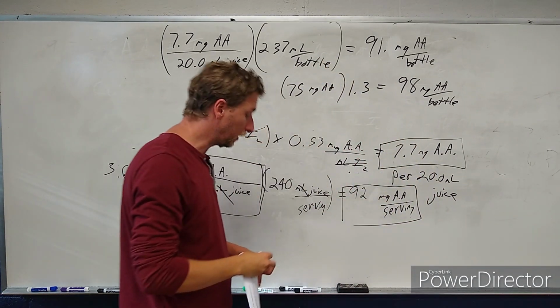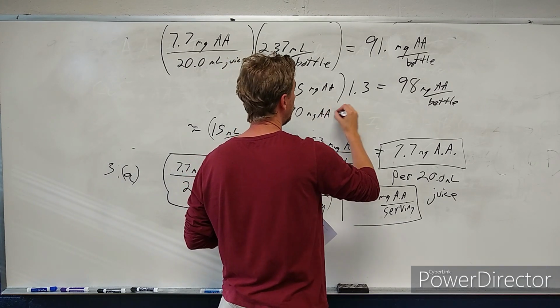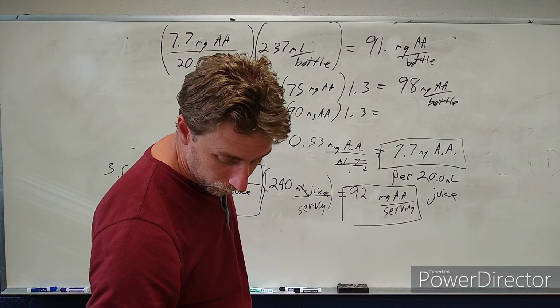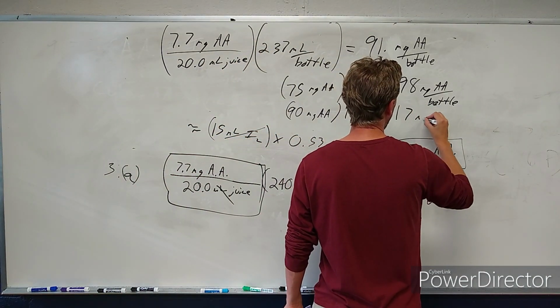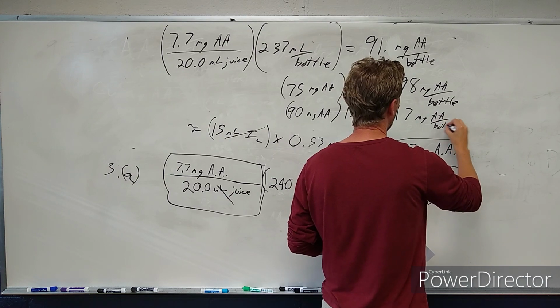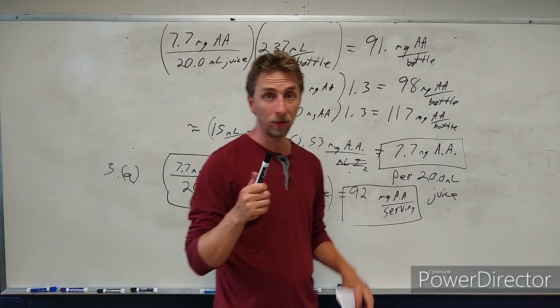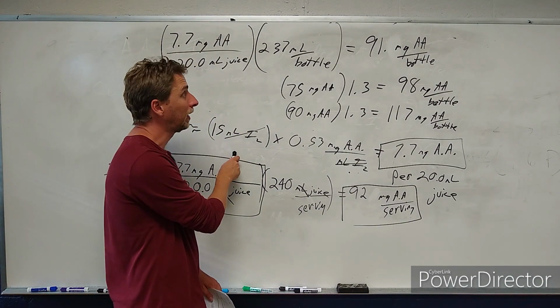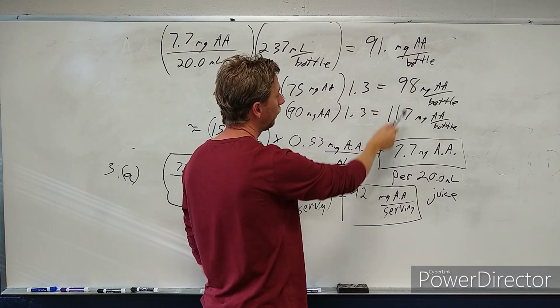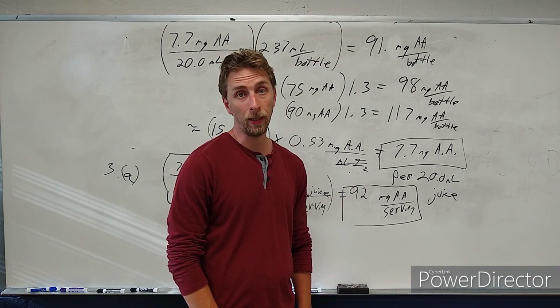from the label. Of course, if it's talking about for an adult male, then it would be 90 milligrams of ascorbic acid times 1.3, and according to the label, it would be 90 times 1.3, 117. So, depending on how you look at it, you can say that this doesn't quite meet the criteria if our results were 15 for the titration for the endpoint. Our results were not. Our results were closer to 20.5, 20.6, higher than this. So that would put this number higher as well from our experimental results, which would come closer to matching one of these values. So maybe we did support the label pretty well. Leave that to you guys to figure out, and let me know of any questions that you have.